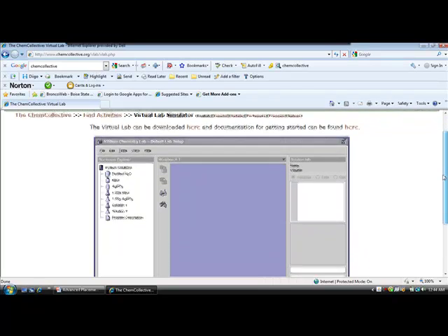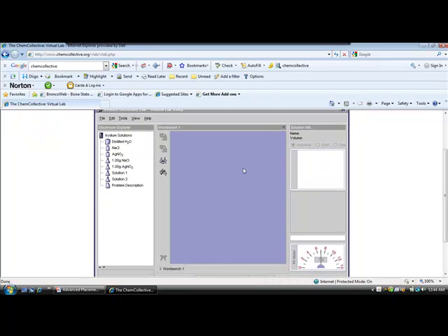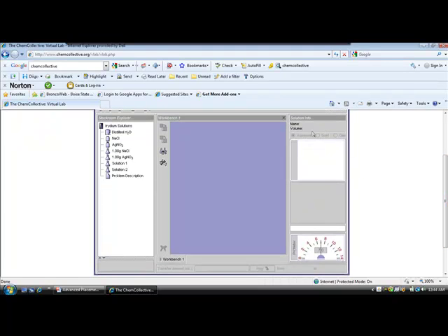This is your lab simulator, and this would be as if you were working back on a lab table, a lab bench. In your lab, you would have certain solutions. These are your stock solutions that are over here on the left-hand side of the desktop. On the right-hand side are meters, which we will get to eventually. There's a meter that reads ions and a meter that reads pH. You also have lab drawers, lab benches, in which you could pull out a beaker, Erlenmeyer flask, graduated cylinders, pipettes, volumetrics. And what they'll do is they'll have these stocked with whatever you might need for any particular type of lab you might be working on.